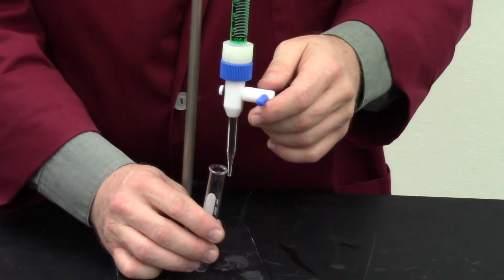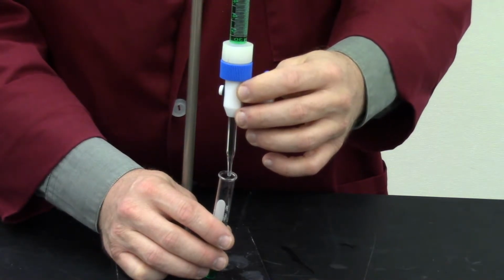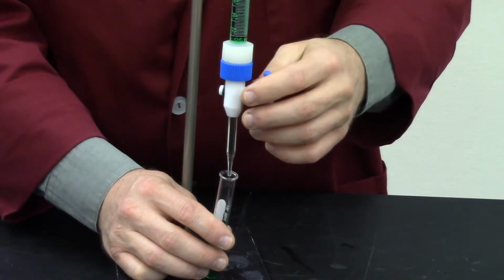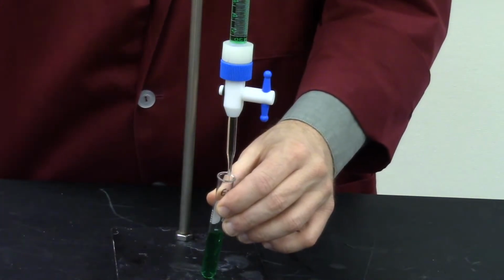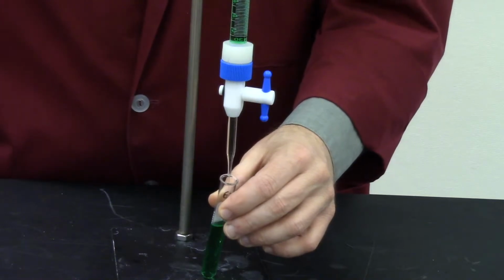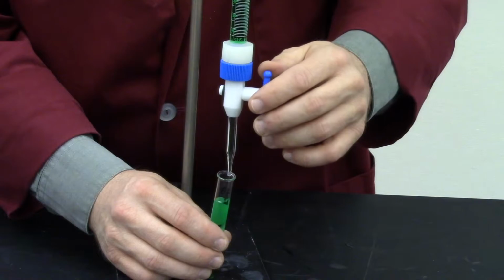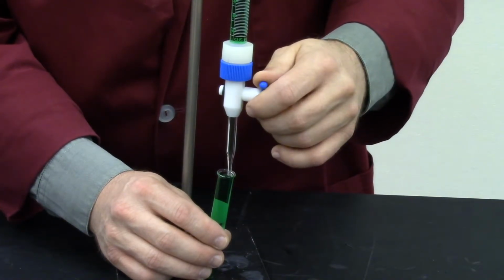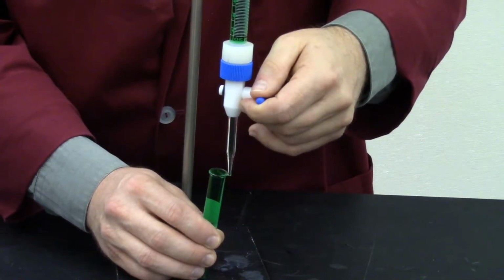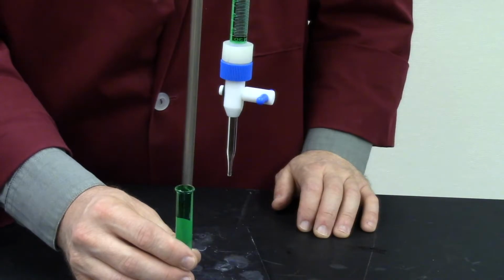All right, class, now we're going to fill this test tube with water. And the next volume you see, the next meniscus you see, will be the final volume. I'm going to fill this test tube to the top, and then we're going to take this material and transfer it to a 25 milliliter graduated cylinder. There we go. So there is the test tube filled to the top.